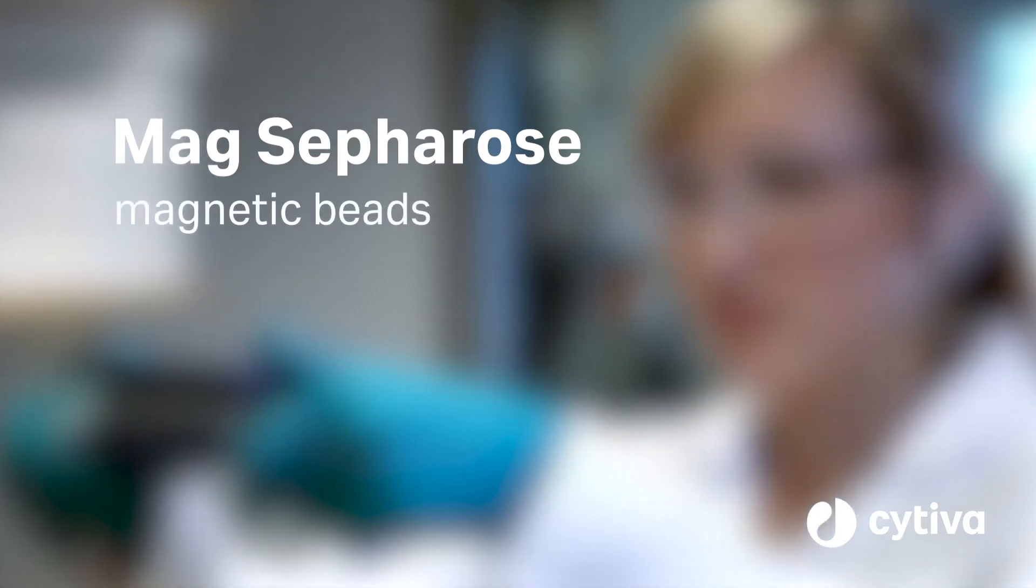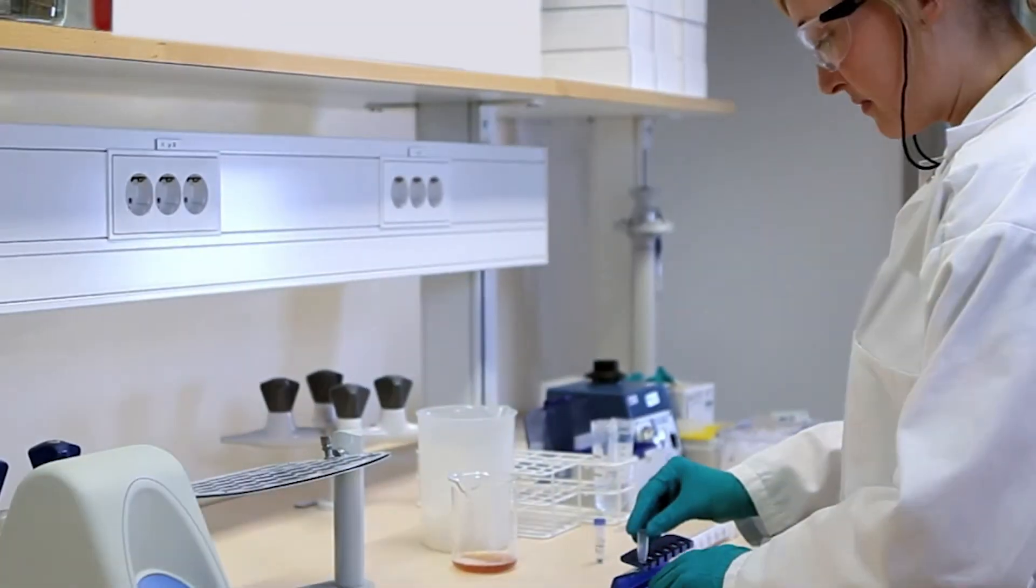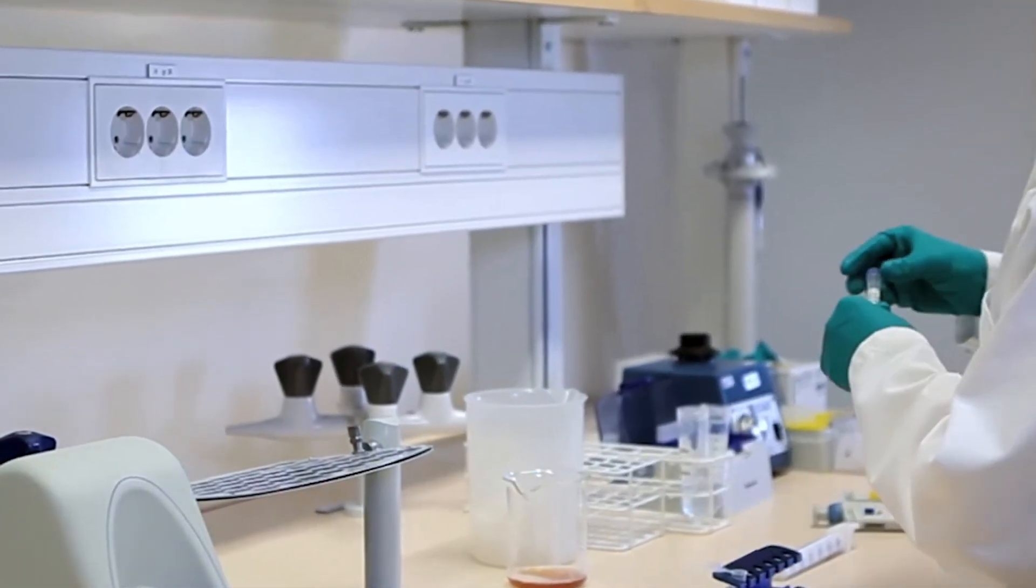Cytiva MagSepharose Magnetic Beads simplify handling and sample preparation for enrichment, small-scale purification, and screening of proteins.